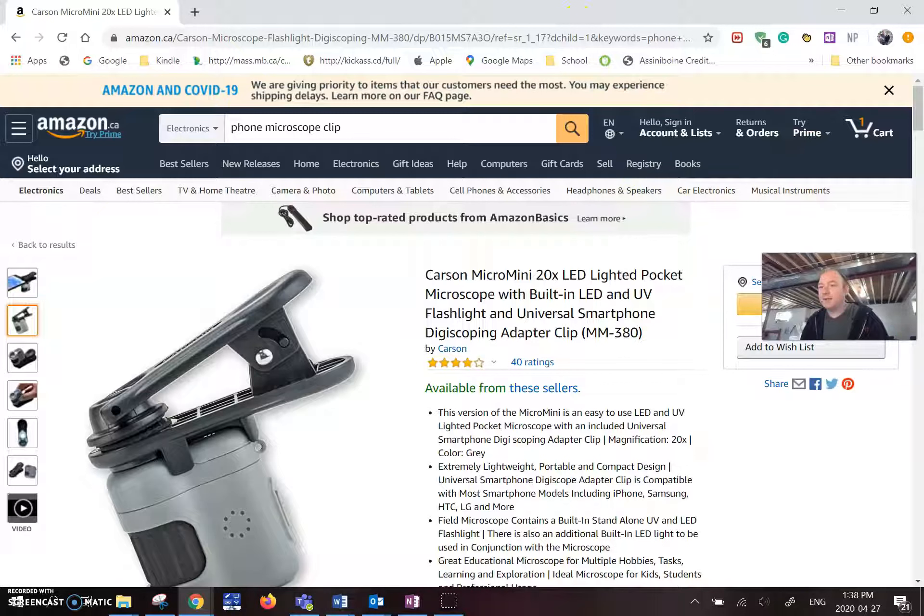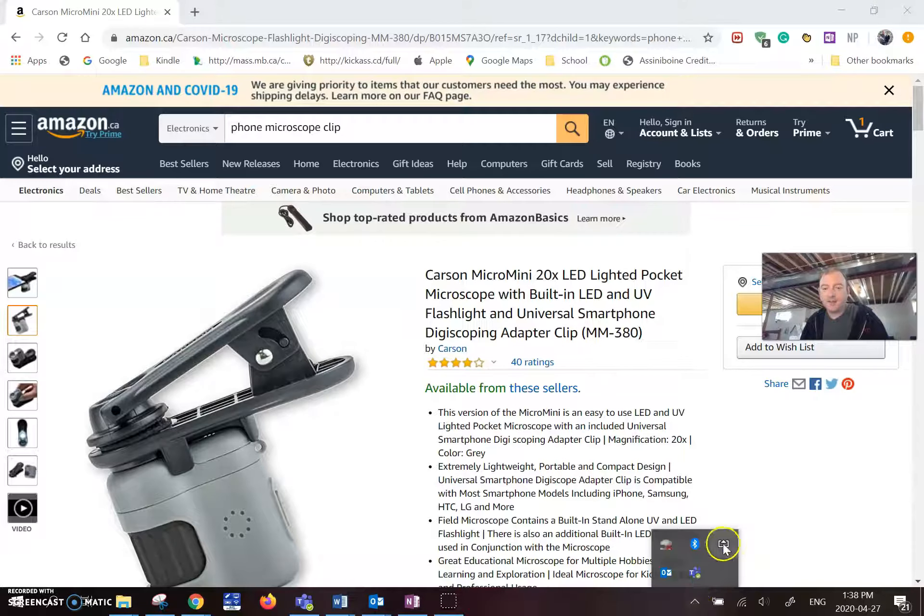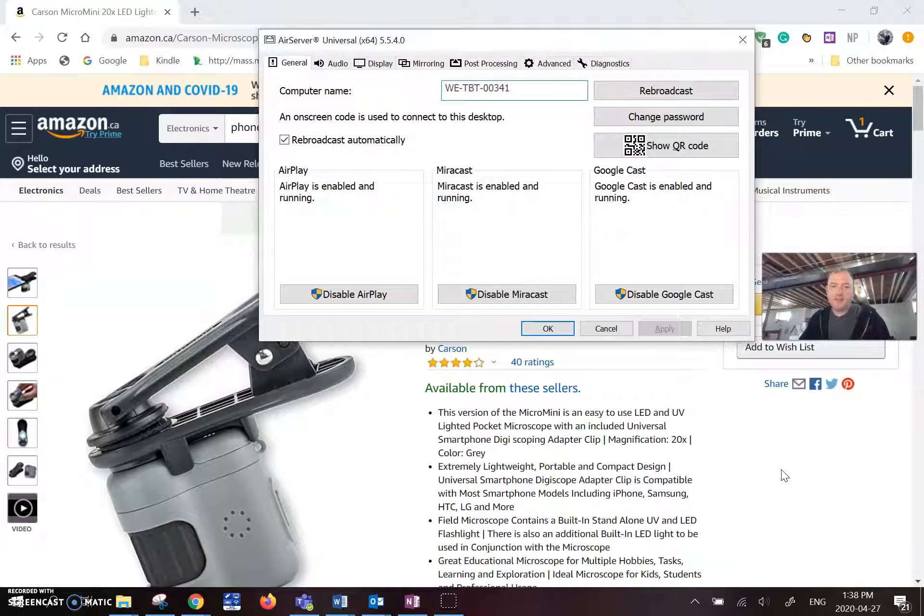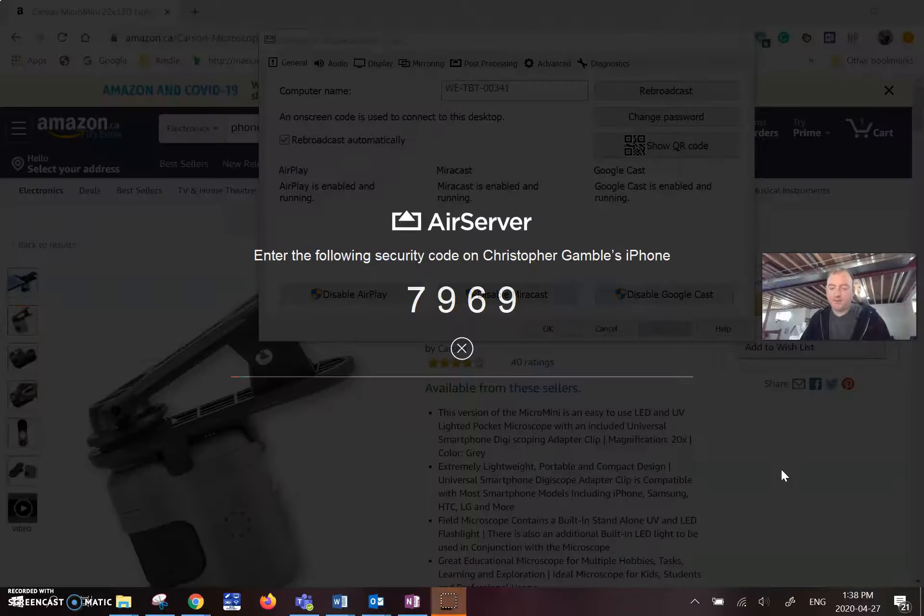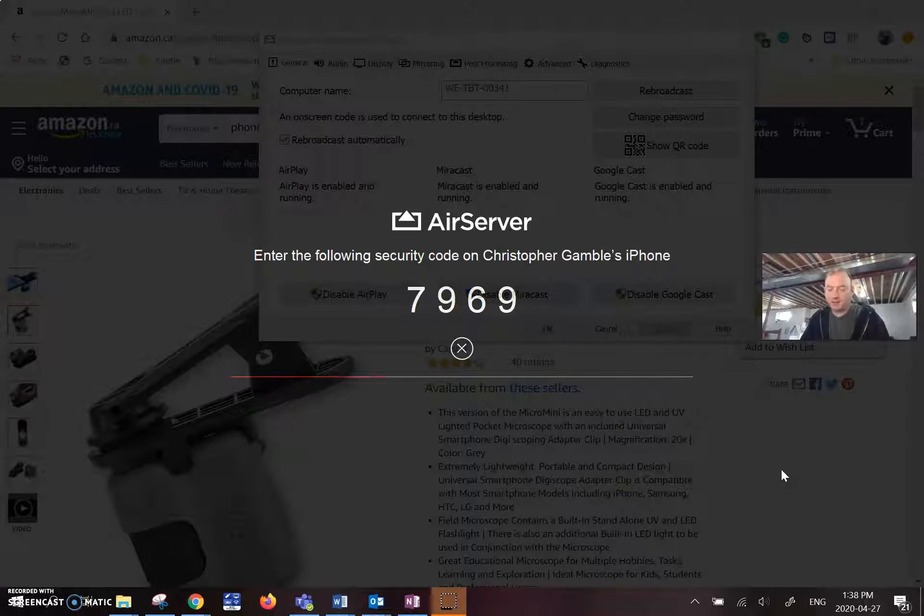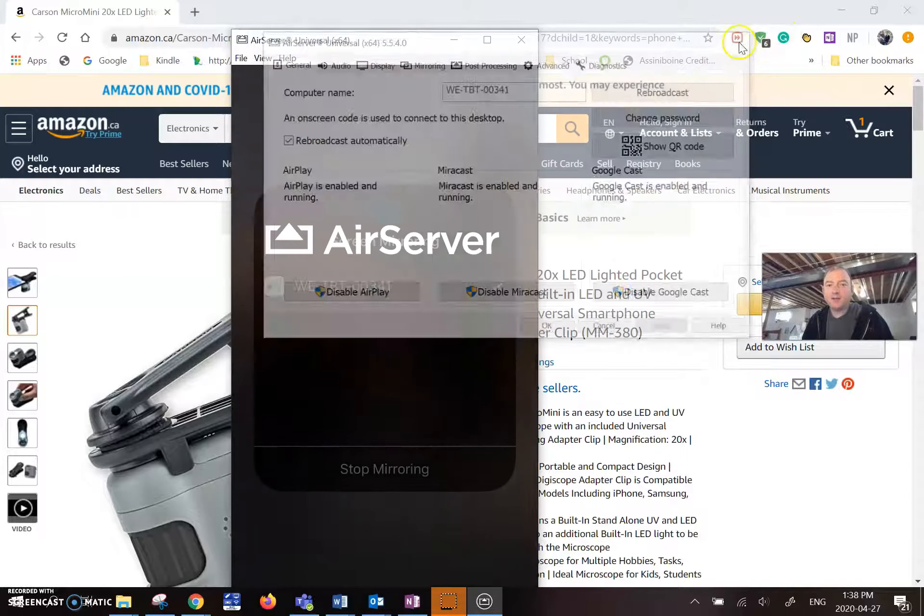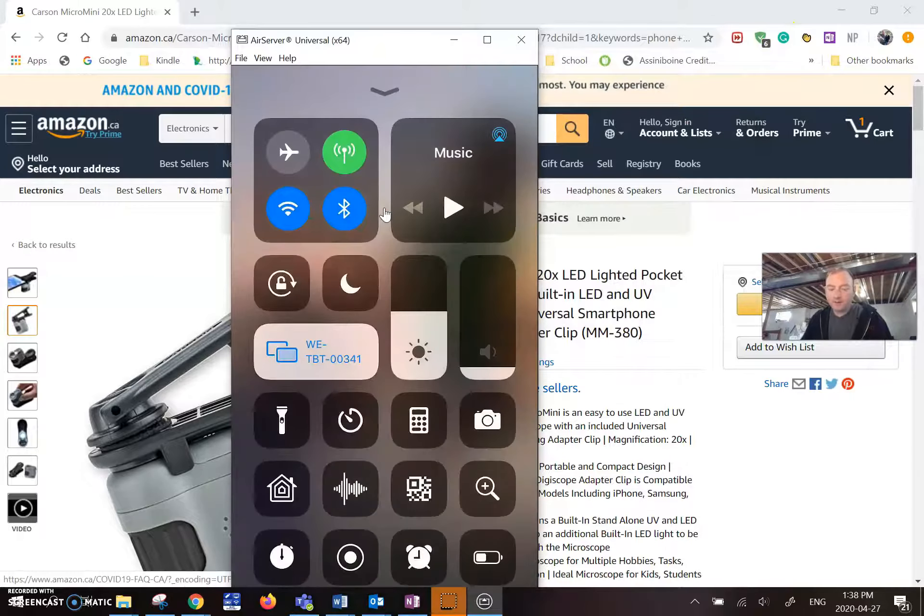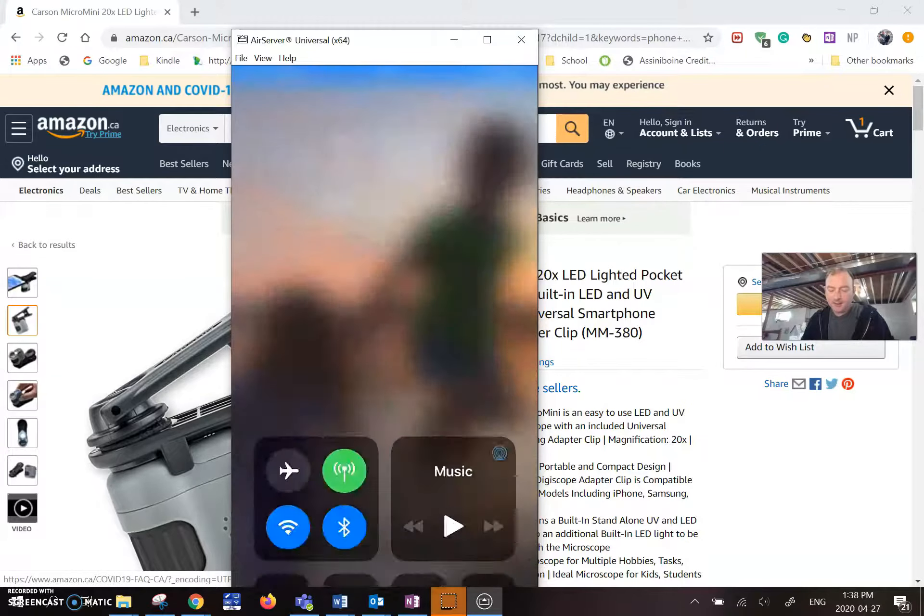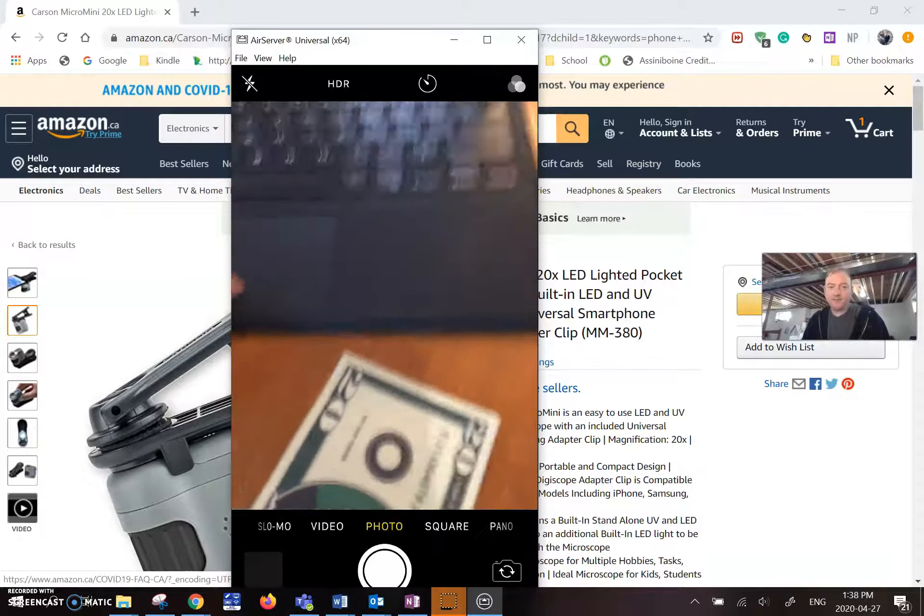And the next thing I'm going to show you here is I'm just going to bring up AirServer, bring up my AirServer stuff here. So I'll type in my magic code. If you want to know how to do this, the instructions for this are in the AirServer tutorial that I made last week. And you can check those out. So you'll see that I've got AirServer opened.